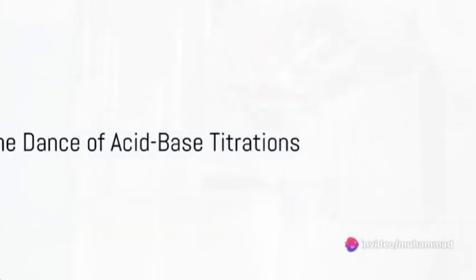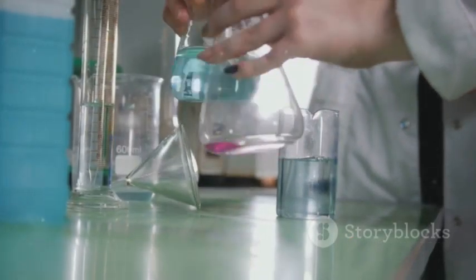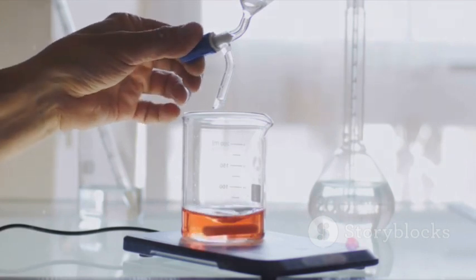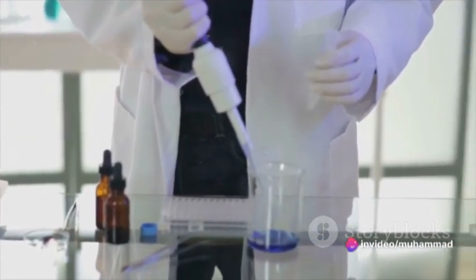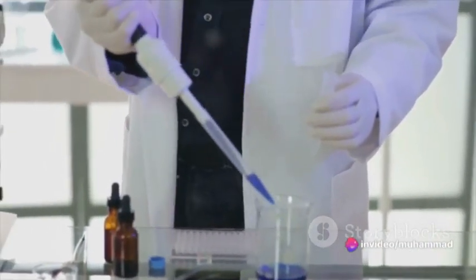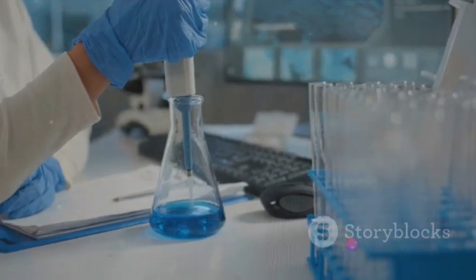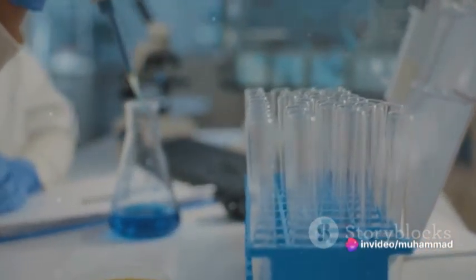Acid-base titrations, in essence, are techniques used to determine the concentration of an unknown acid or base. This process is akin to a well-choreographed dance that occurs in a beaker. Each step is meticulously planned and executed with precision to achieve the desired result. The performance begins with a known solution, a standard solution, which is carefully measured and poured into a beaker. This known solution could either be an acid or a base depending on what is being tested.